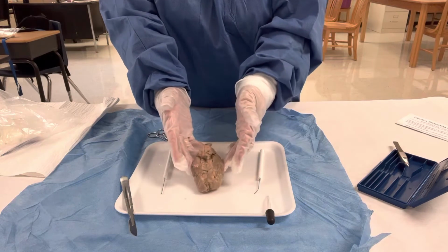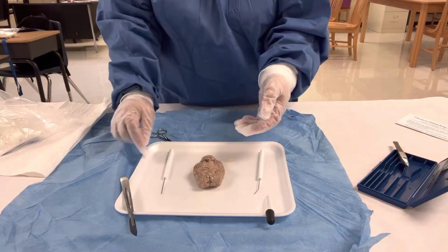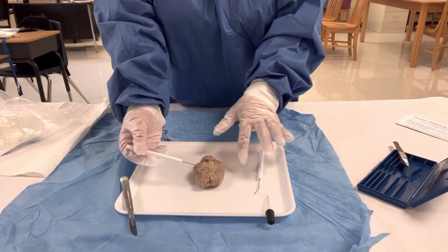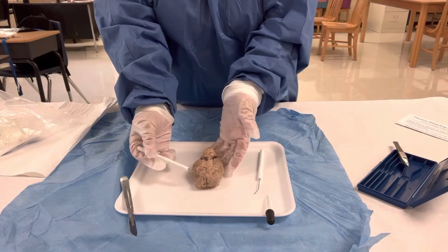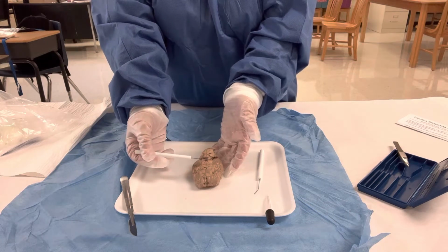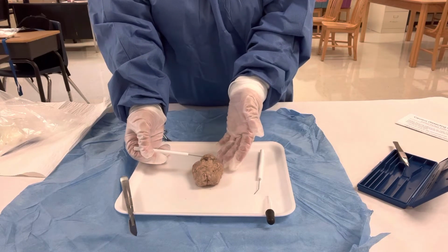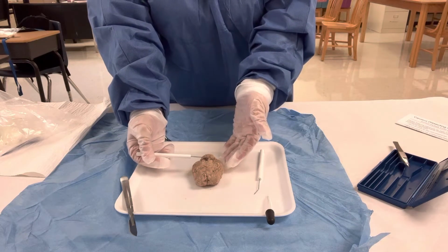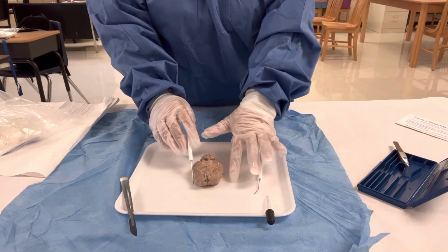Okay, so this is my sheep brain. This is the, oh Lord have mercy. This is the frontal lobe right here, and it plays a part in smell plus dealing with motor function. This is the parietal lobe, which handles all sensory information except vision, hearing, and smell. This is the occipital lobe, and it receives and interprets visual sensory information. And then these are the temporal lobes, and that's for hearing and smell.